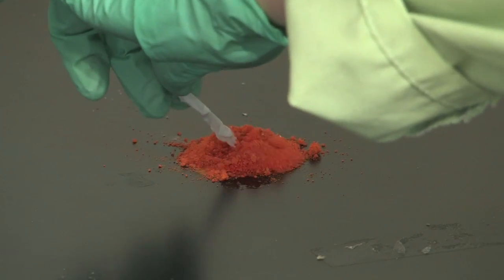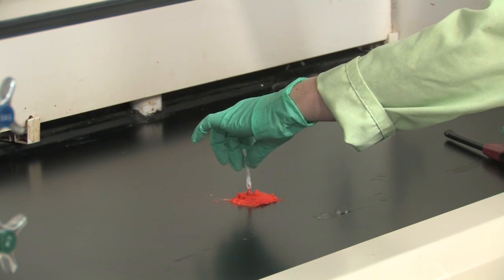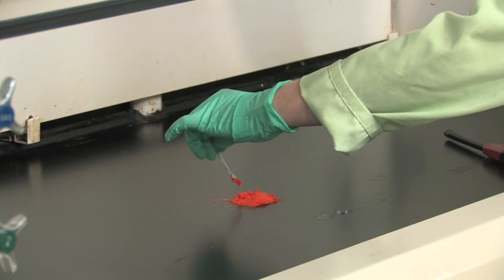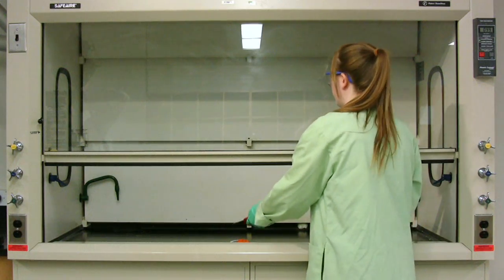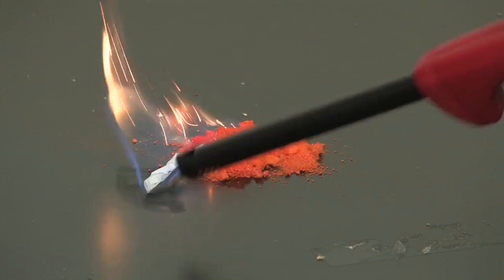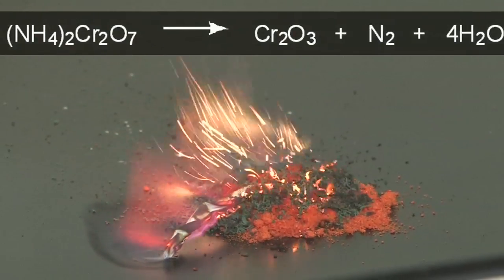If I can get it to stand up — it doesn't look like it wants to work. And now I'm going to light our fuse. And as you can see, this is a very exothermic reaction and it's decomposing quite rapidly.